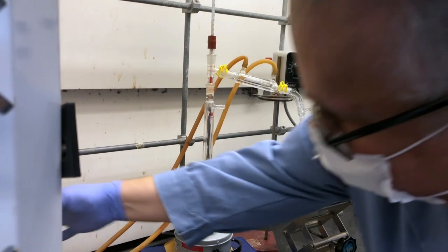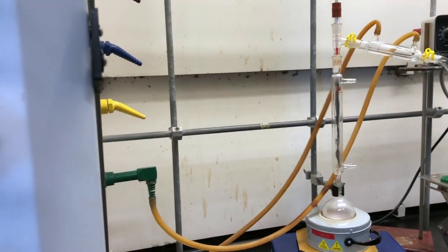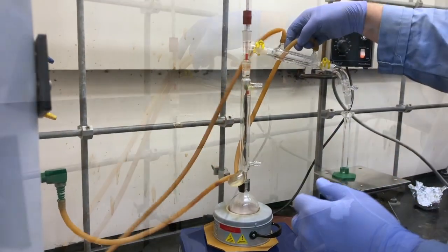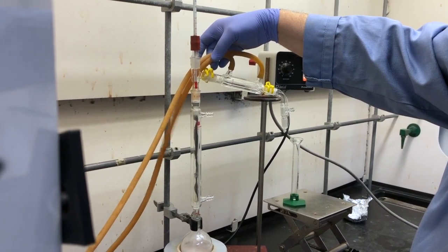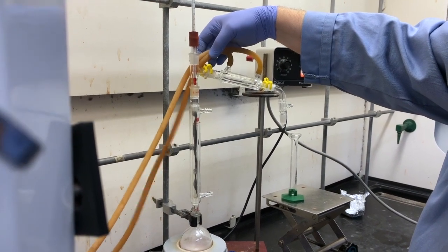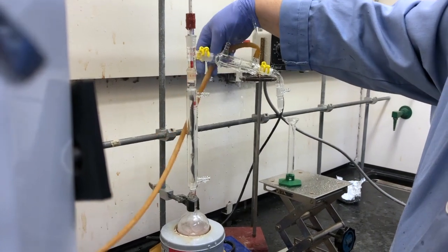We had a problem with the water hose — the water inlet was not working very well. It didn't flow evenly and a bulge formed in one of the tubes. There was back pressure in the line, and eventually the pressure built up so much that the hoses popped off and water went everywhere.